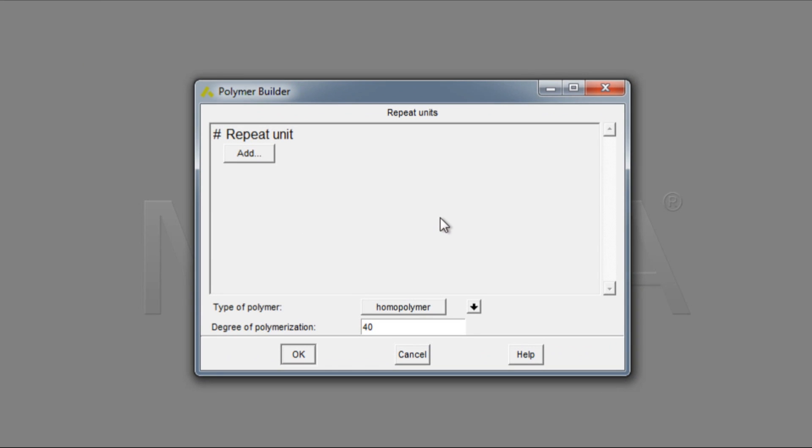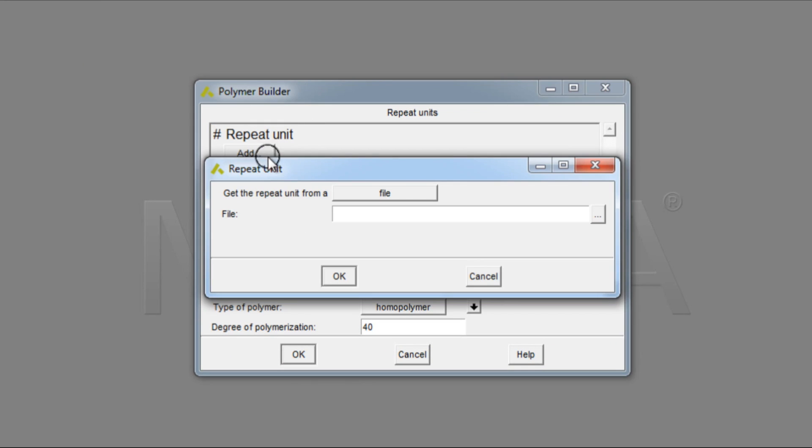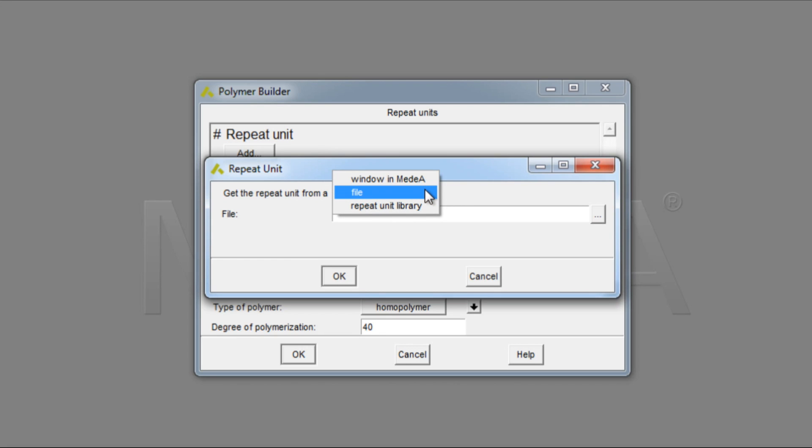Under the Repeat unit, click Add, and we can choose from an active window in Medea, or from an existing file, or from a Repeat unit from the library.